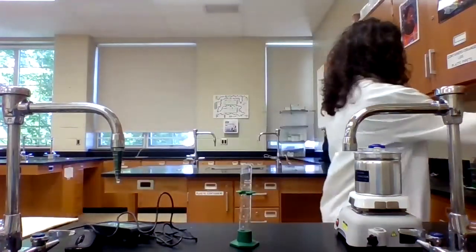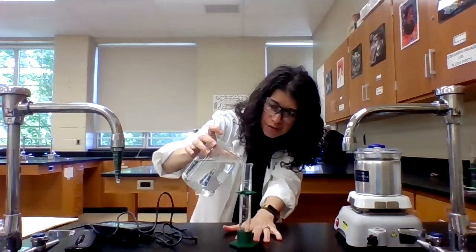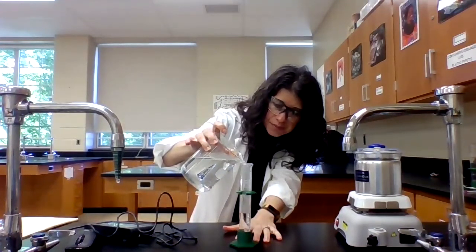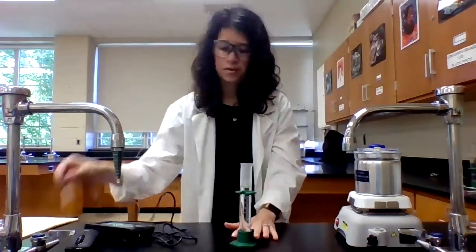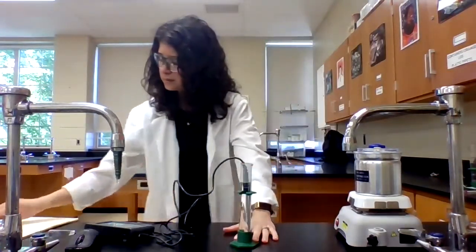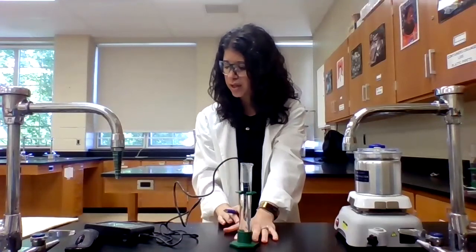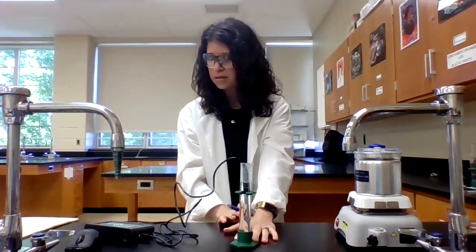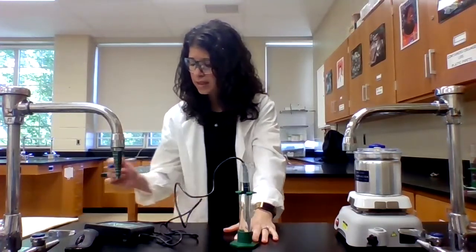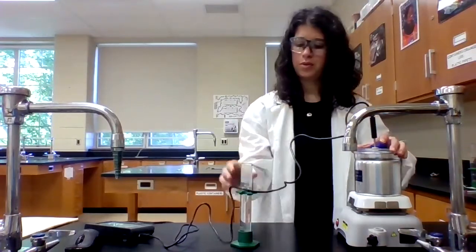All right, so I'm going to take my water that's been heating up on a hot plate and measure out 50 milliliters of that. Insert my temperature probe here. I want to give it about 10-20 seconds, make sure that it has an accurate temperature. So right now it's at 59, but it's still climbing a little bit. All right, now it's kind of stabilized. So 59.8 degrees Celsius.